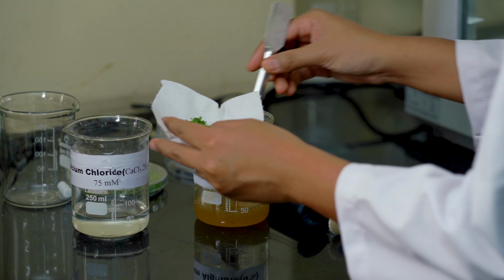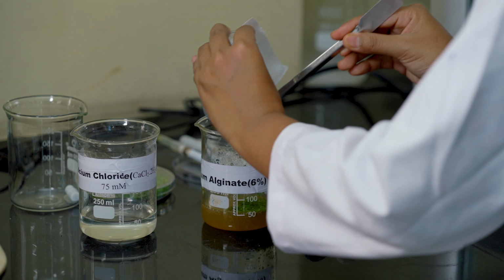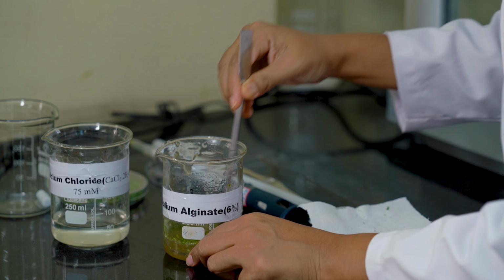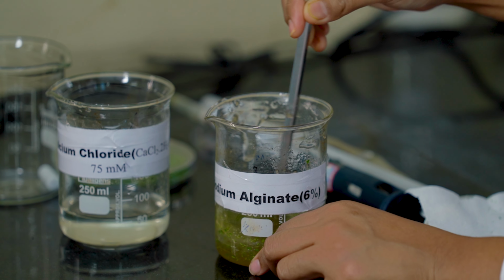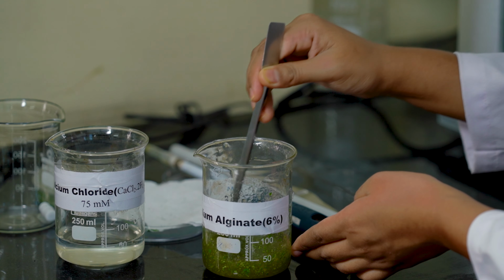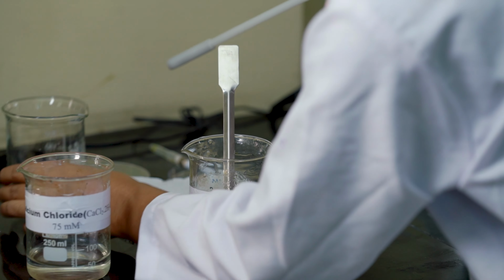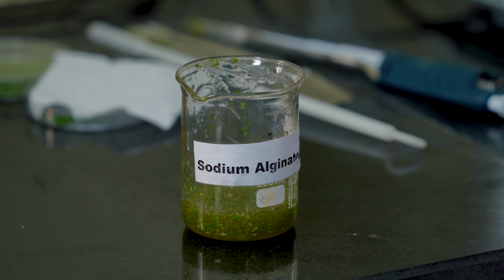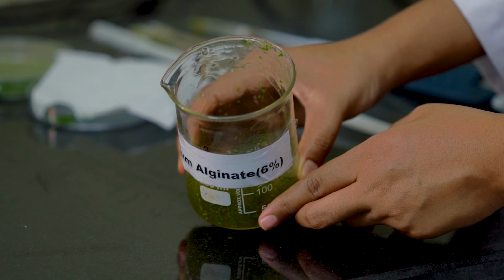Now mix the somatic embryos generated from citrus into the sodium alginate solution. These somatic embryos are mixed with the sodium alginate solution which we have already prepared. The somatic embryos are mixed properly so that it forms proper beads once we drop them in calcium chloride solution. As we have seen, this somatic embryo of citrus has been properly mixed in the 6% sodium alginate solution, so this will be used for preparation of artificial seeds.